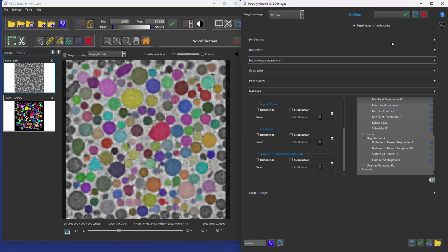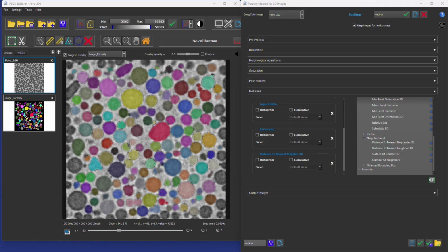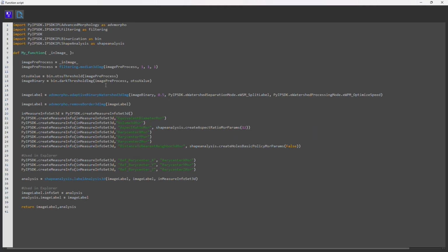And now, if you want to save it, you can just call it webinar, you can save it, and now I have my webinar entry that is here. I can close everything, and you can just apply it. And you will get your results as all the steps that we've been doing. So you just create that, you get your profile. Here they are, the results. And here it is. And if you want to get the equivalent Python script, you can get it here. So that's exactly the steps that I've been doing. So the different filtering, the different morphologies, the metrics that I was interested in.